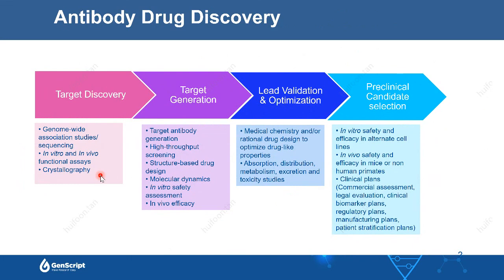The crystal structure analysis of the protein-ligand complex allows the study of the specific interactions of a particular drug with its protein target at the atomic level. It helps to design and improve the drug.